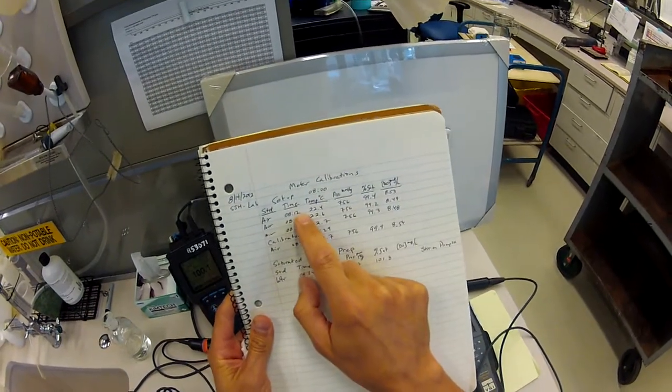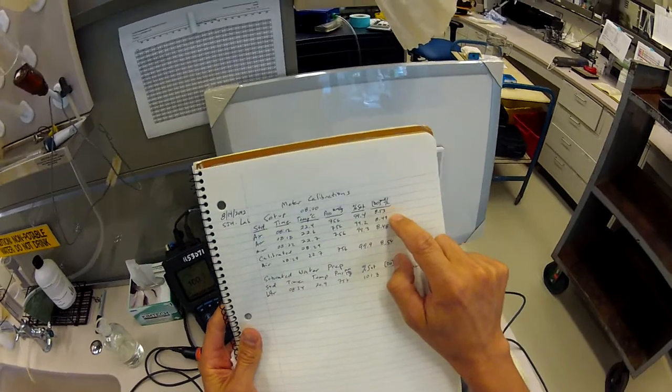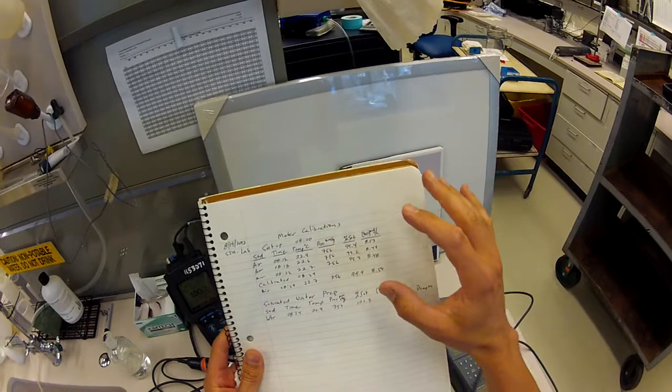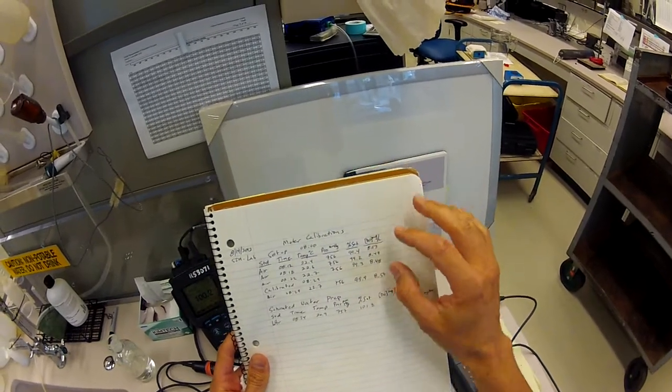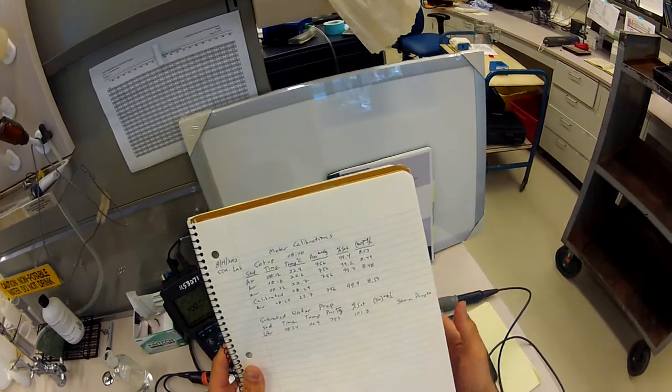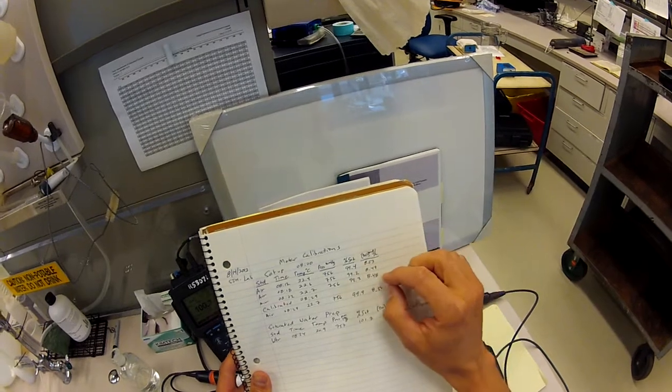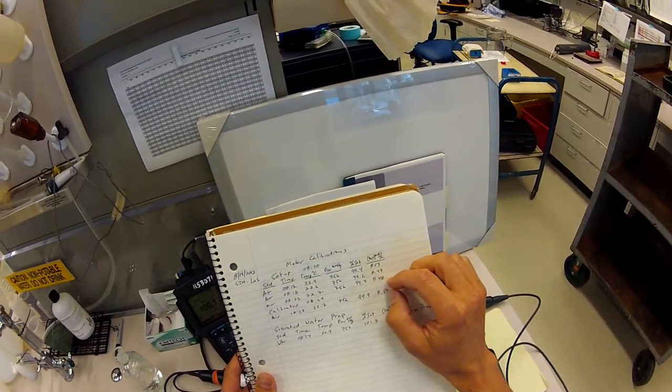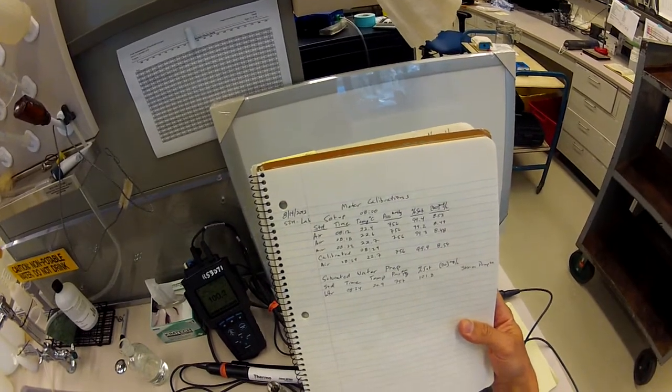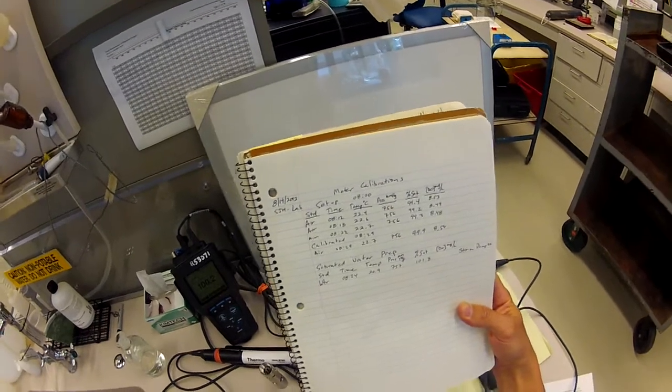And then about five minutes later I could repeat that, and if I'm within one tenth for both temperature and for milligrams per liter, then I'm good - I'm ready to move on. I've got a stable saturated air standard. If I'm off by more than a tenth on either temperature or pressure, then I'm gonna go ahead and wait another four to five minutes. So what we're looking for to say we've got stable standard is within a tenth for temperature, within a tenth for milligrams per liter on both temperature and milligrams per liter over the course of four to five minutes. If you're hitting that, then you can call it stable and move on to calibration.